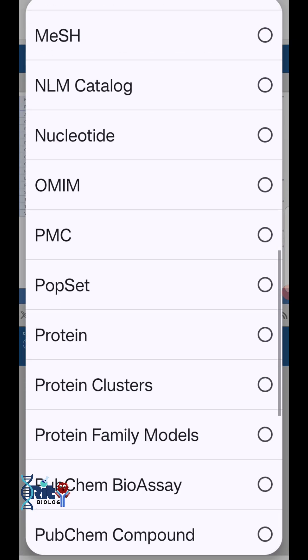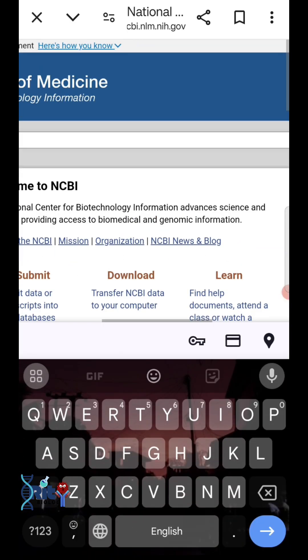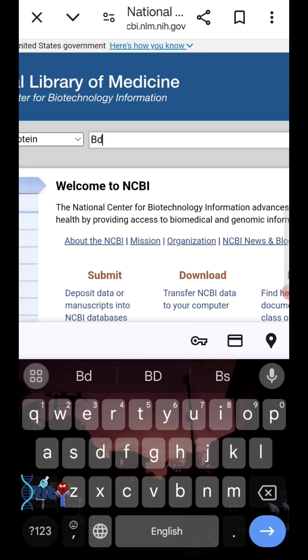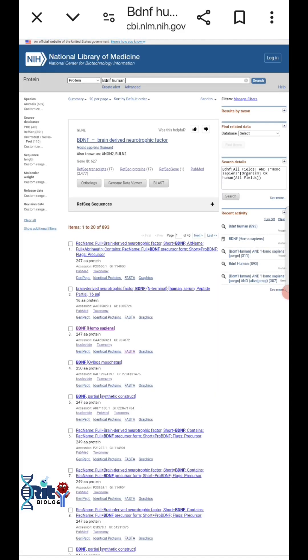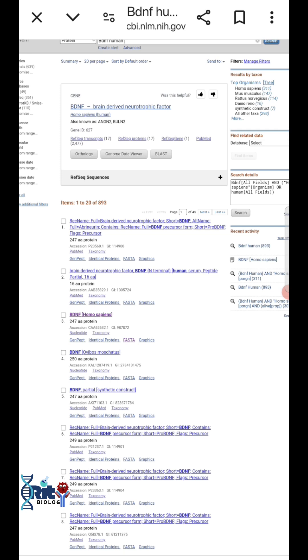Search for your targeted protein, then choose the main type of your protein. Here you can find all other partial sequences, but you should just choose the main type.